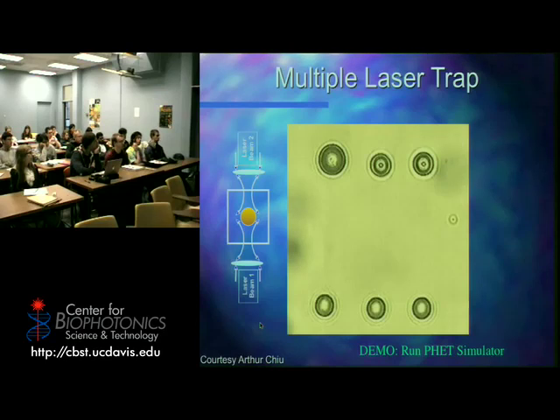And the way we can do that is by flowing a whole bunch of these cells through a system and selectively grabbing a cell at a time, investigating and seeing if it's healthy or not healthy, and binning it, putting it on the side of the healthy cells or on the side of the unhealthy cells. And you do this for long enough, you get a population of healthy cells that are from the patient that I can feed back into the patient, and hopefully that will lead to them generating more and more and more, and they'll get better. And they won't have any of the rejection issues.